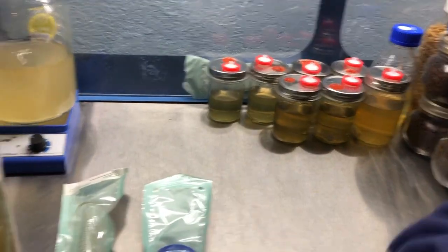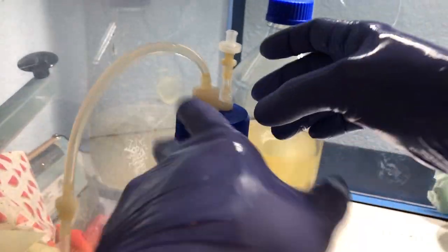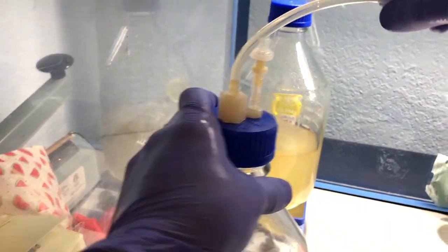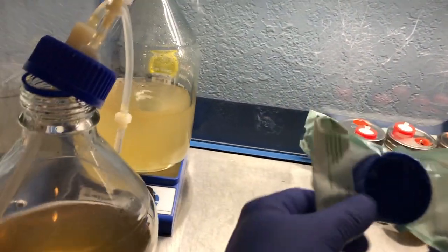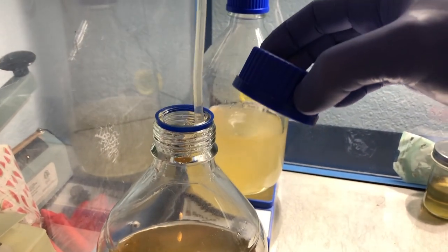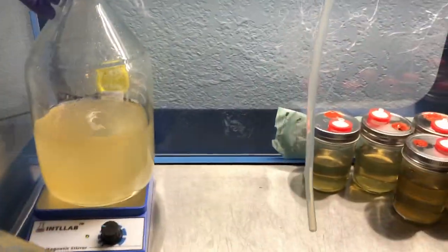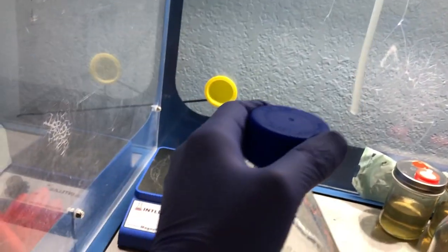Okay, guys, so the first thing I'm going to do is transfer the extractor from this sterilized liquid culture onto our Morchella liquid culture. So I've sterilized this extra cap here to cover this 2-liter bottle of liquid culture that I sterilized, and then I'm going to be switching over to this very thick bottle of Morchella liquid culture.